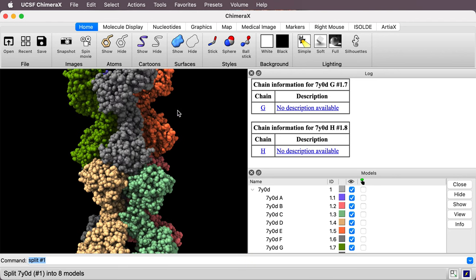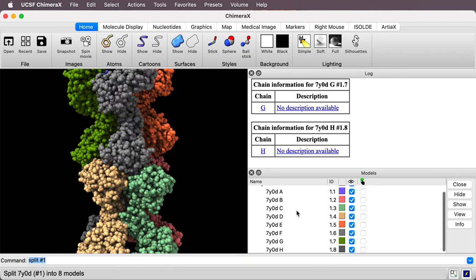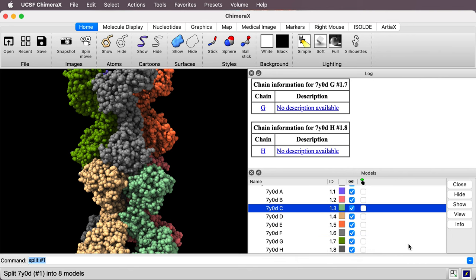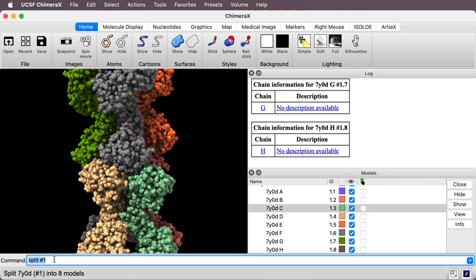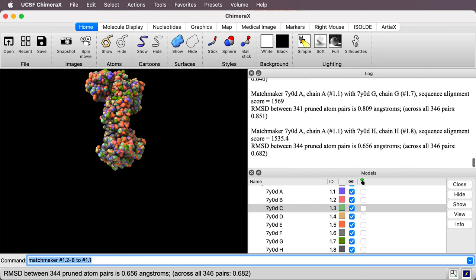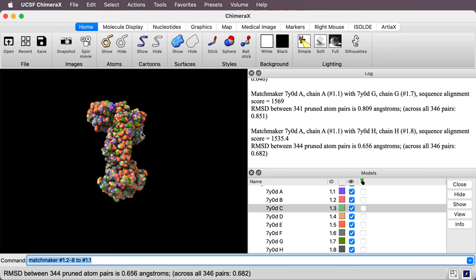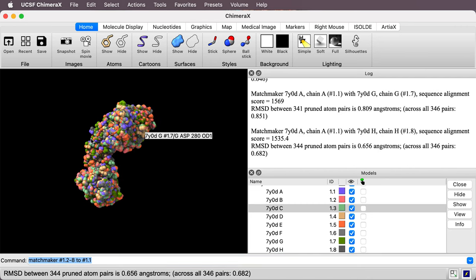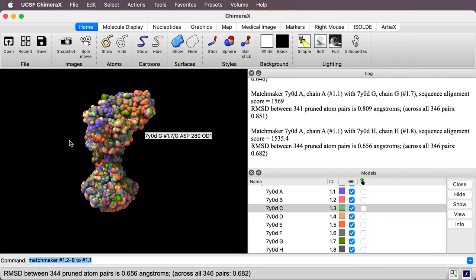So you see in the model panel at the right I now have models number 1.1 through 1.8 and I can align them with the matchmaker command. So I'll say matchmaker number 1.2 through 8 to number 1.1. So this will align seven of the copies, number two through eight to number one. All right so they're all aligned now. That minimized the C-alpha distances between the different copies.